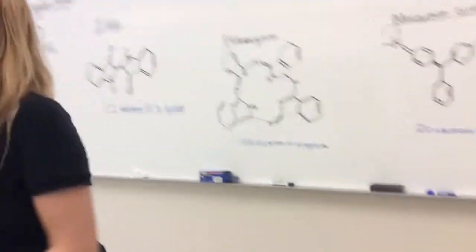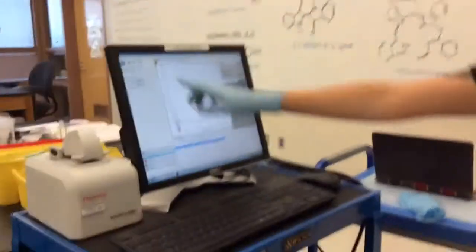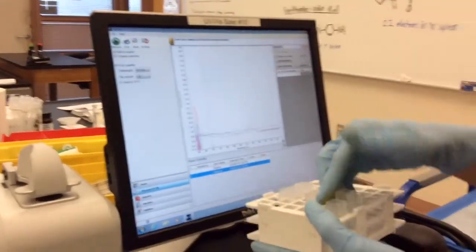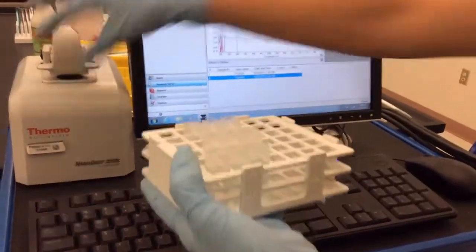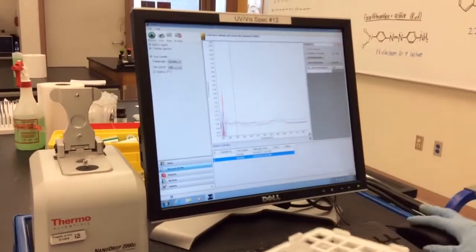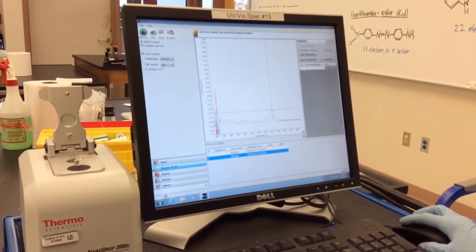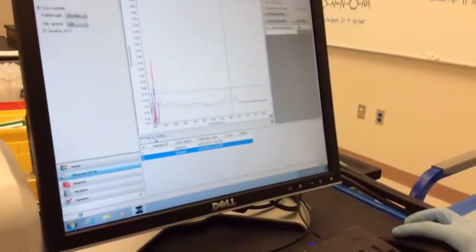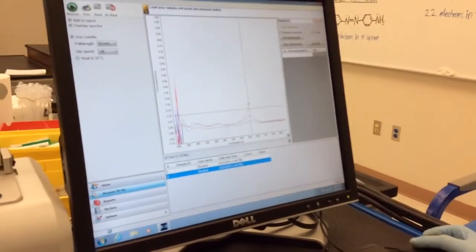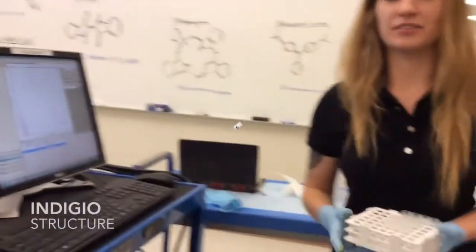When we come over to the UV-VIS, we started with a blank. We started by blanking it, and these are our 3 cuvette samples. So malachite green absorbs a wavelength of about 617 nanometers, and these are our dilutions, so the stronger our concentration, the more it is going to absorb at that level.